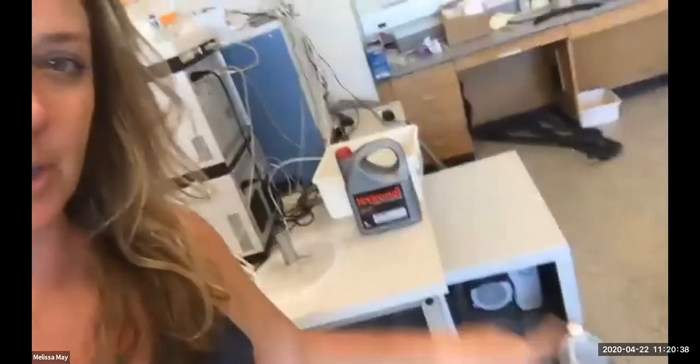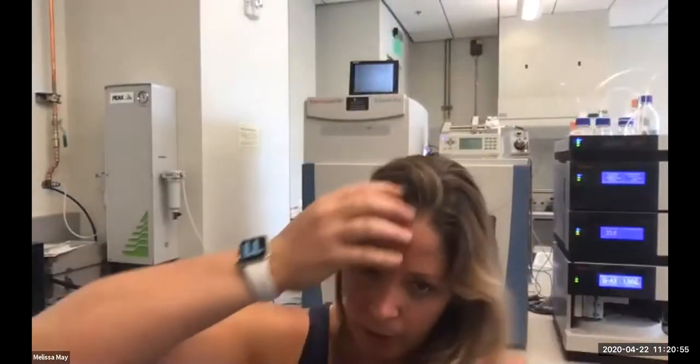And then if we walk around to the back side of the instrument, there's one other component, which is right here on the floor, which is the fore pump. The fore pump is a separate unit. It needs to have maintenance done to it yearly, which is mostly just an oil change and occasionally the filters changed. But if that is not working, again, your mass spec will not work.